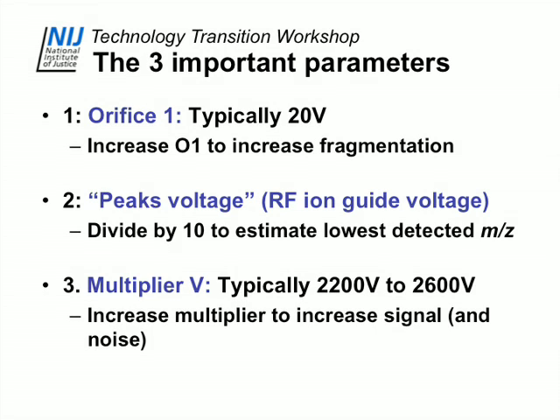You have a voltage on the microchannel plate. Increase it, you get more signal. Decrease it, you get less signal. But if you increase it, you also get more noise. You're increasing both signal and noise. So that should be set based on some standard measurements.